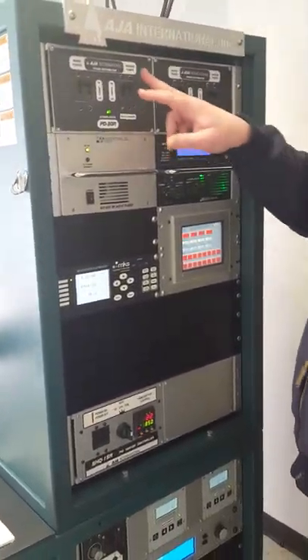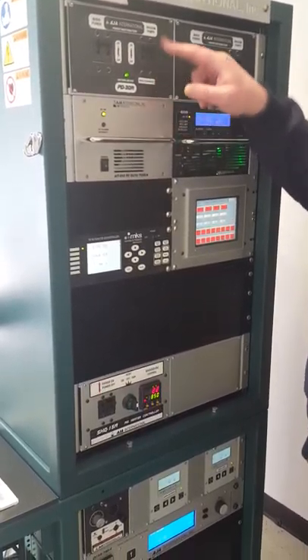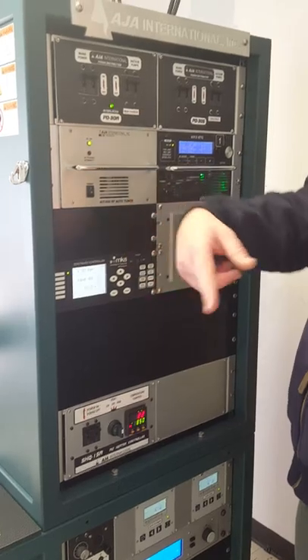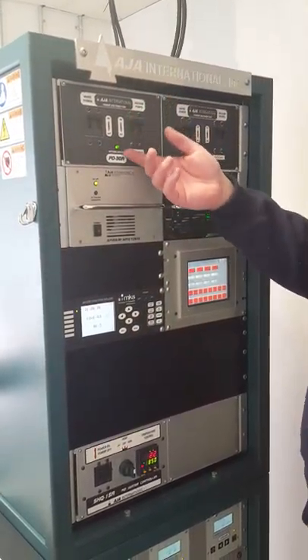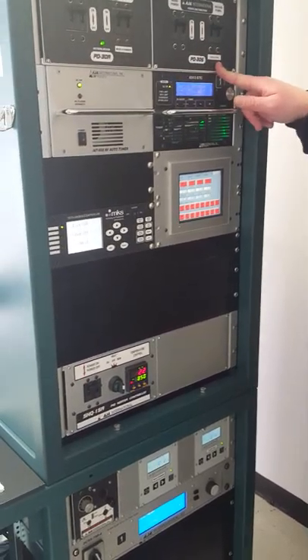Each box also has a breaker for the vacuum pumps. This one's for the main chamber — you turn this off and it'll turn off the vacuum pump immediately. The turbo will spin down. When you're ready to pump again, you just turn it on. And then we have one for the load lock — same thing.